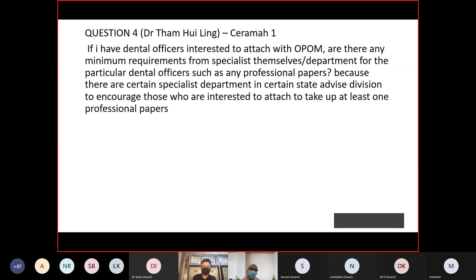It was sent by post. It wasn't packed properly. The seal was not tight, and so there was leakage of formalin. It was sent by air. So formalin was everywhere. It leaked up onto the outer box itself. The post laju refused to send it to us because it was just reeking of formalin.